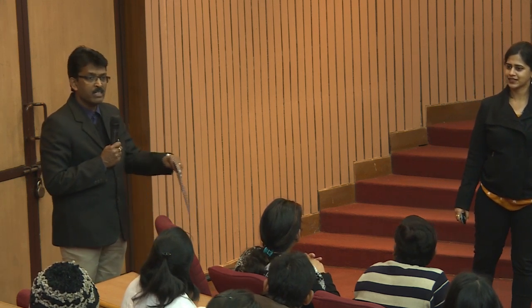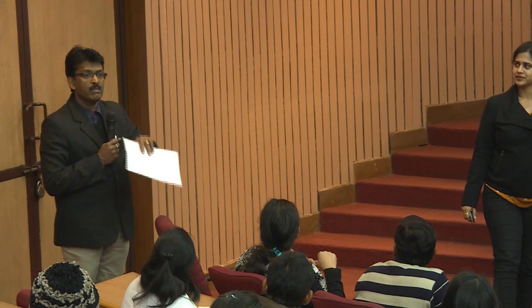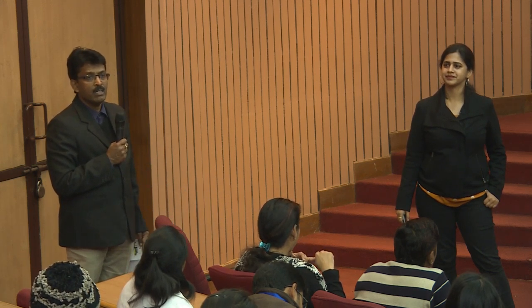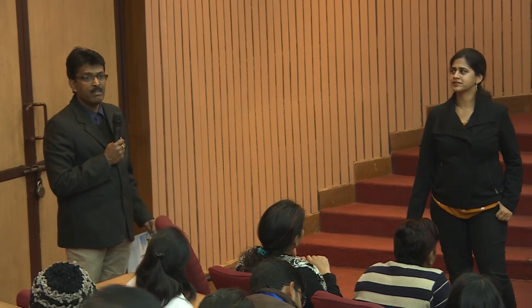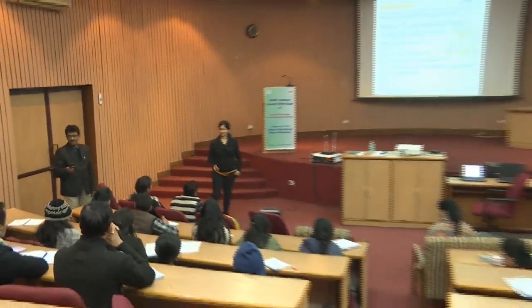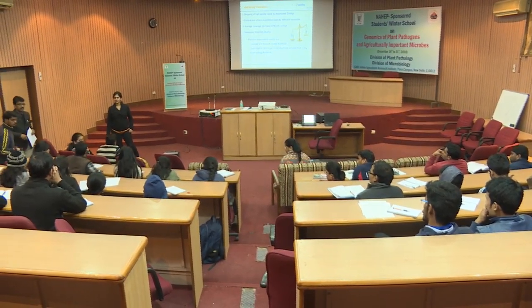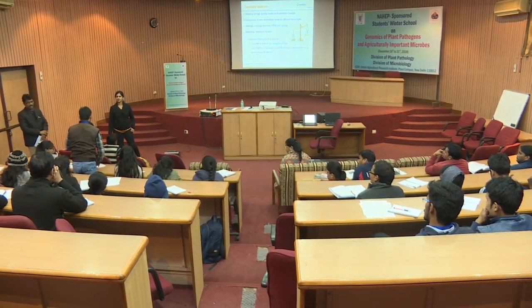For the students, that is a point actually. It's nice that she opened up the topic. You have random error in PacBio long reads, because one of the speakers highlighted it here, and Illumina maybe has systematic error, they say. But when we combine these two, the random error and the systematic error will be corrected by either reads. Am I right? Yeah. What is the difference between systematic error and random errors?